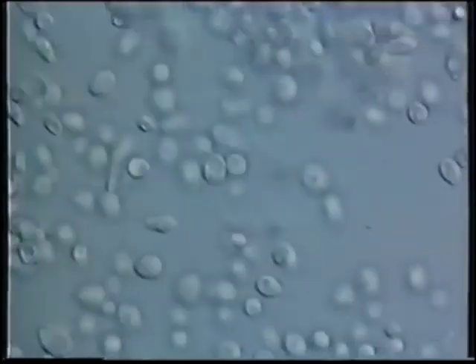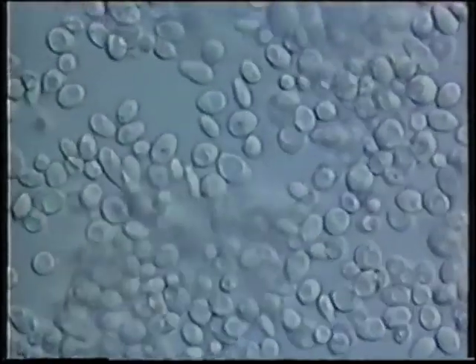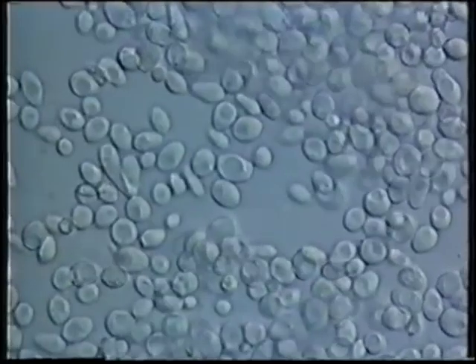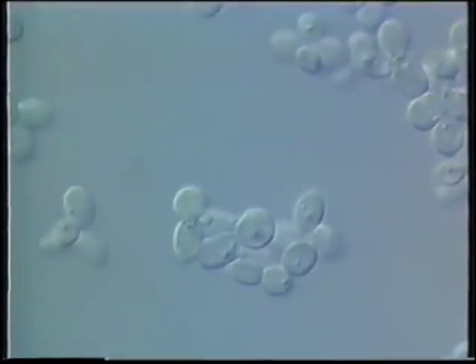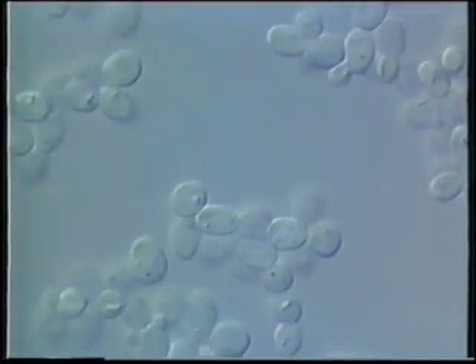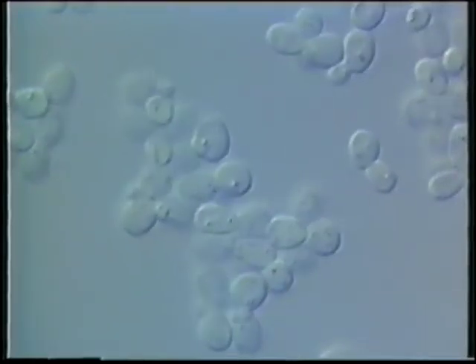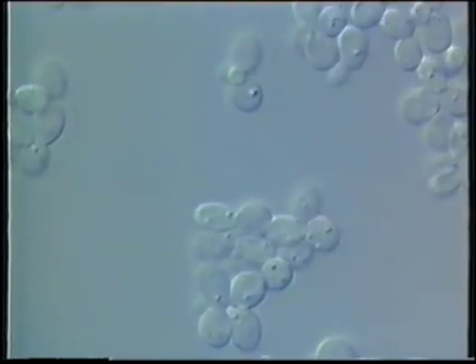We can see it's only 5 to 8 micrometers long that convert the sugarish extract into beer. Similar yeasts make wine and bread and many other products for us. Laboratory strains, such as the ones we are now seeing, play a central role in today's biological research.